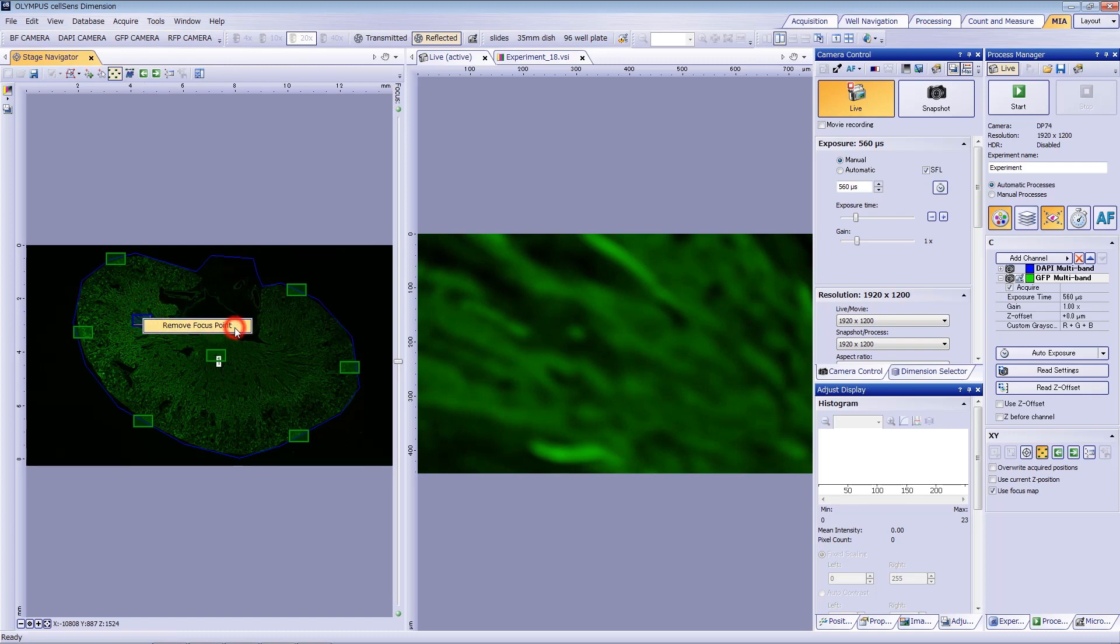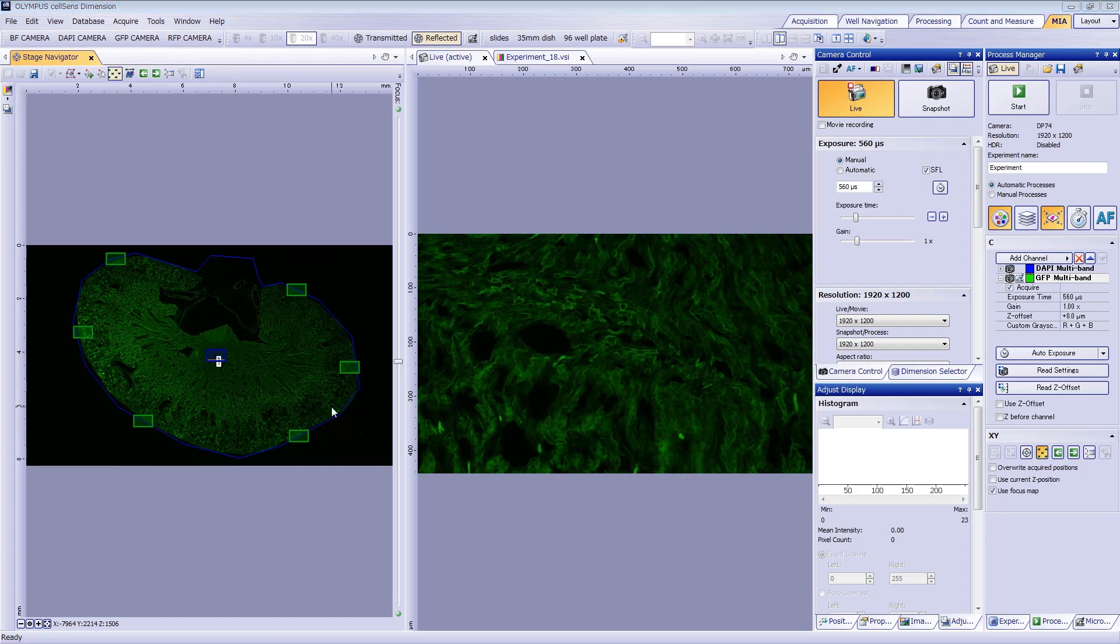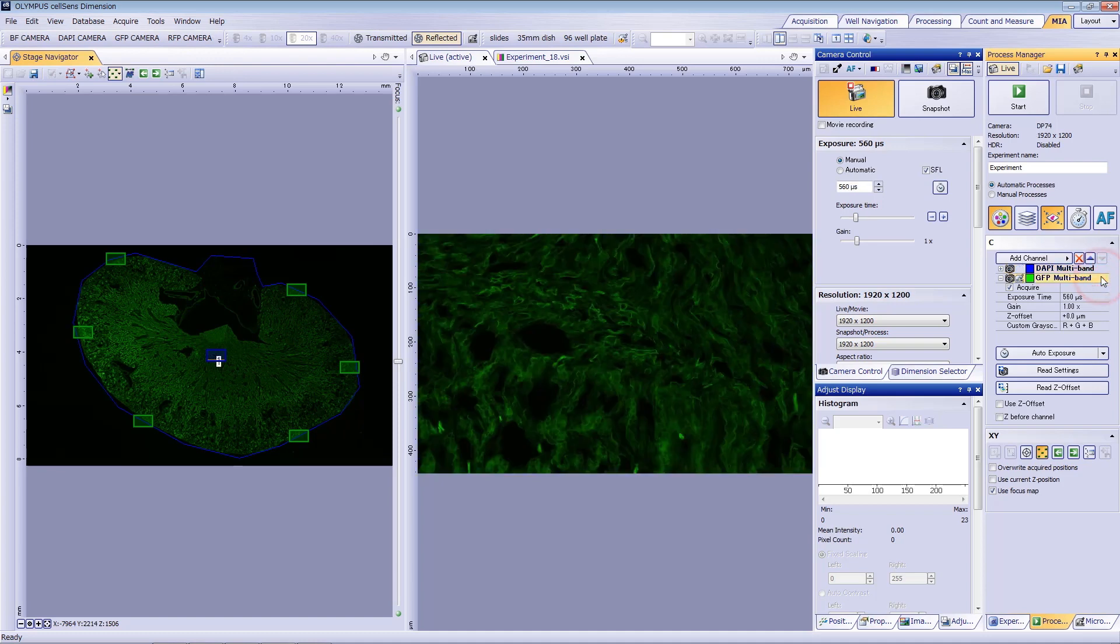Once you're satisfied, navigate to the process manager to check your exposures and focus for all your channels. Image acquisition will begin with the selected channels. In this case, DAPI and GFP. Make sure that Use Focus Map is selected. Then click Start.